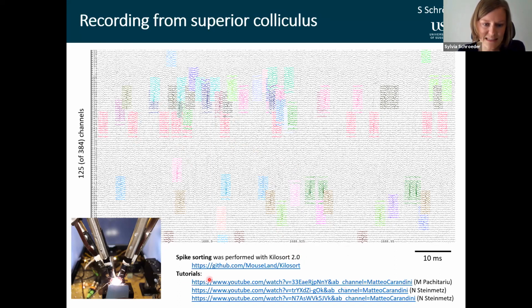There's lots of tutorials available online on YouTube, which you can look at, and they talk about how Kilosort works and also how you can use it, because it's semi-automatic. There is a manual part to it, and in these videos you can learn how to use this.